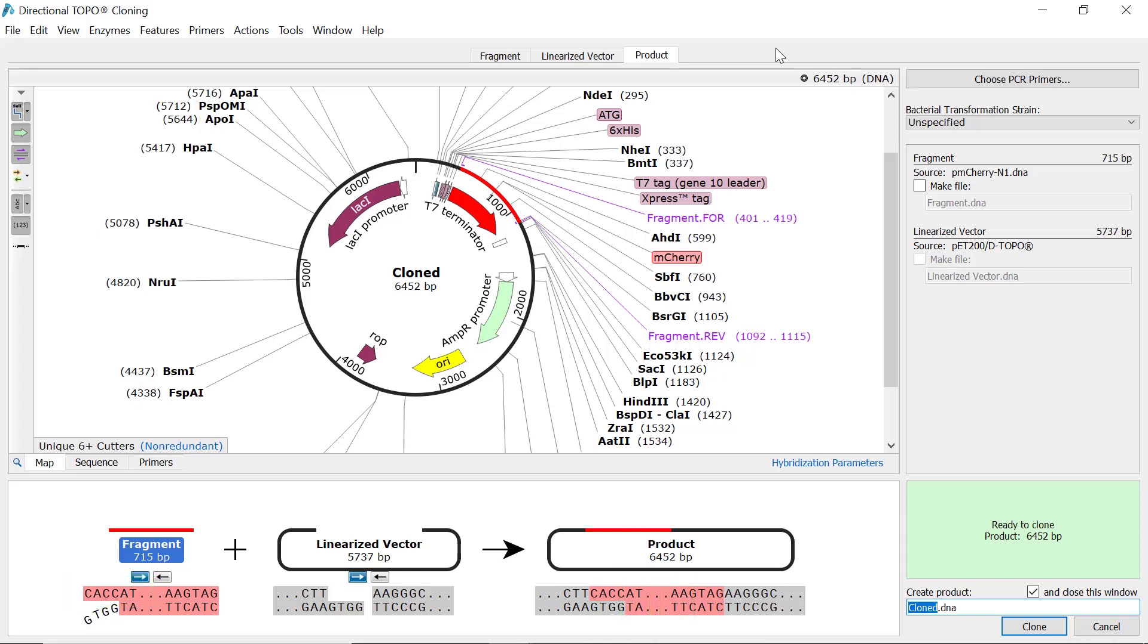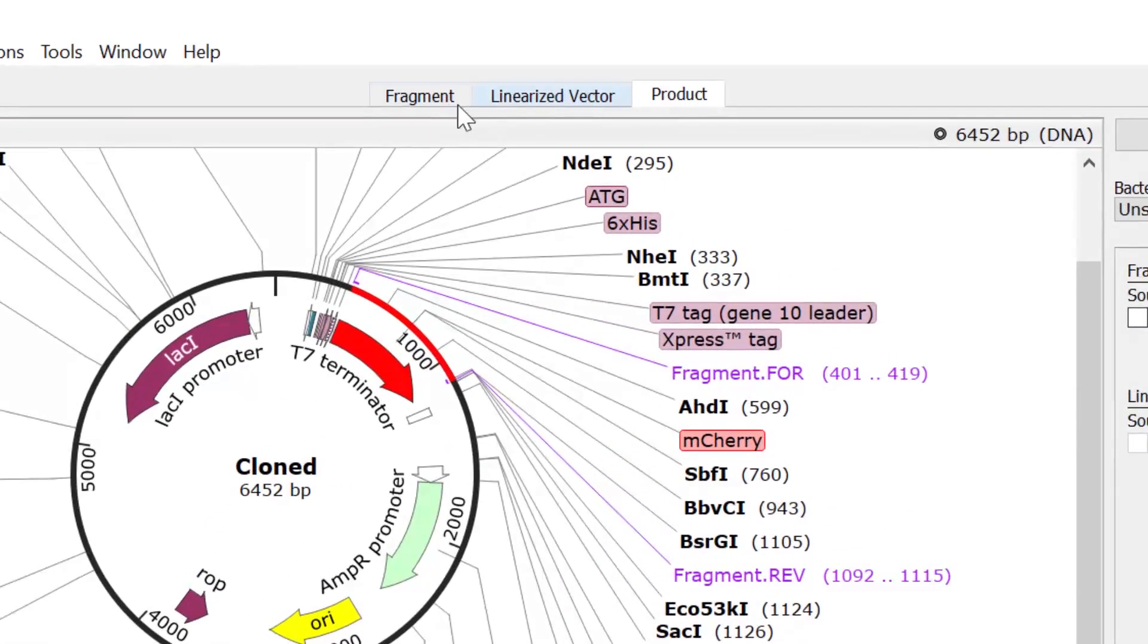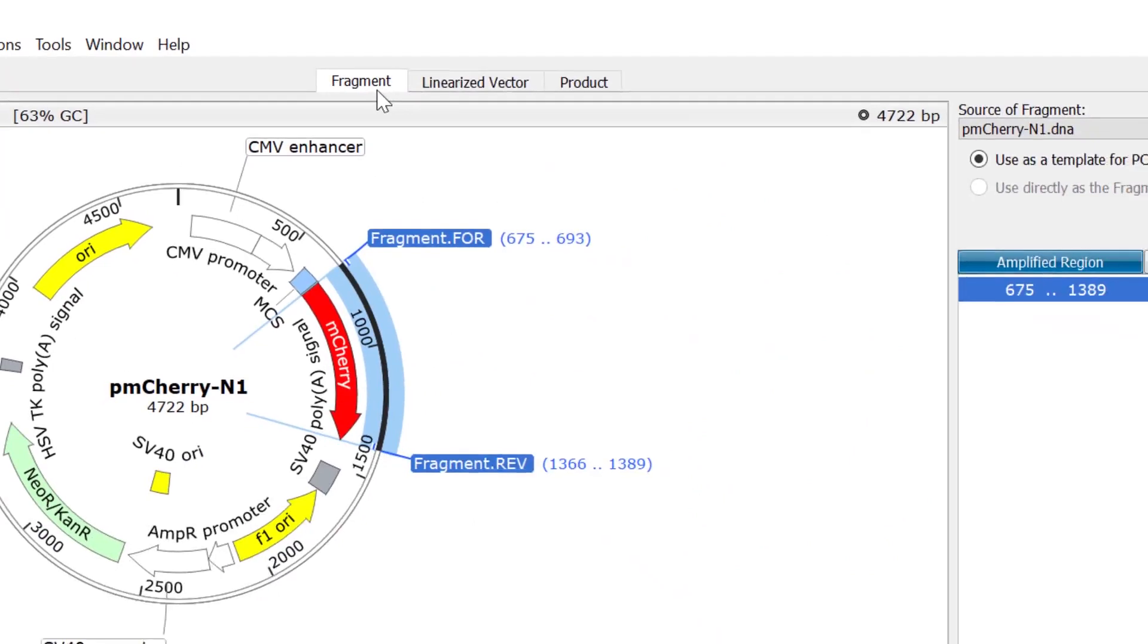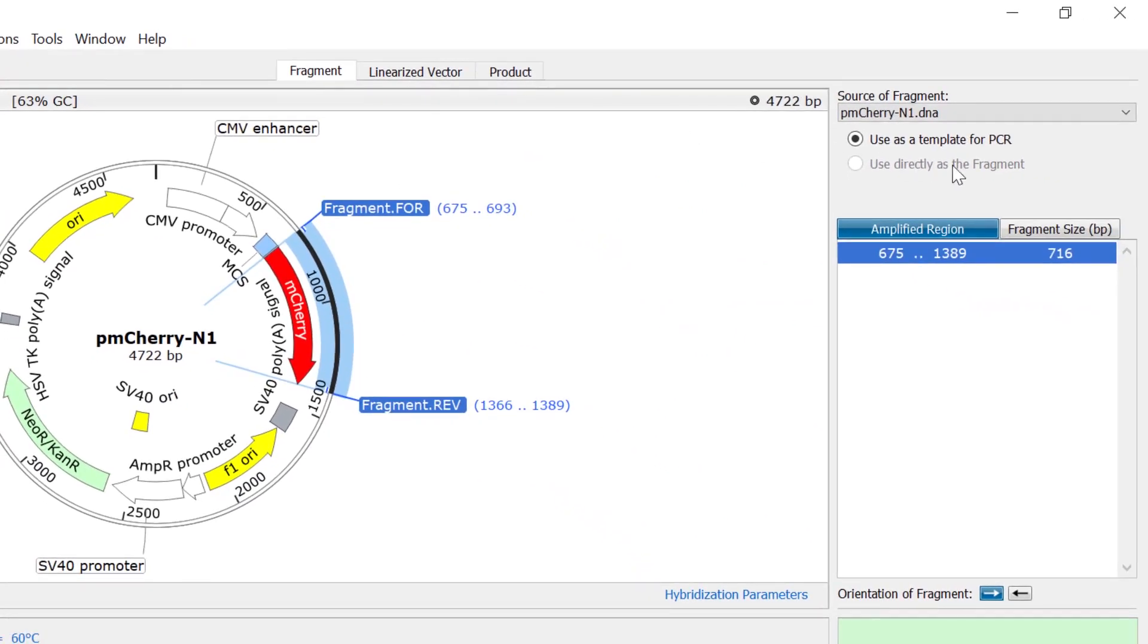If your fragment already has a 5' CACC motif present, there is no need to add this to the forward primer. In this case, you can switch to the fragment tab and select the use directly as the fragment option.